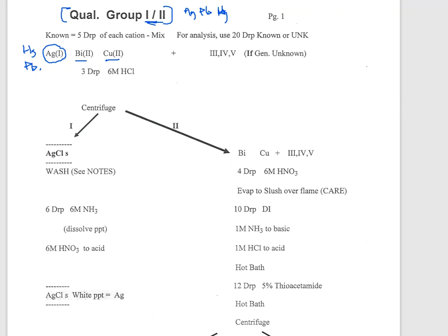If we have to pick one out of these three just to do a group 1, we're going to pick silver because it's a little bit easier for us to take steps to clean it and to keep it and to dispose of it. The mercury and the lead, money, money, money, money. That's what that takes in order to dispose of it the proper way. All right, so that's why you see silver listed, but that's why mercury and lead is not there.